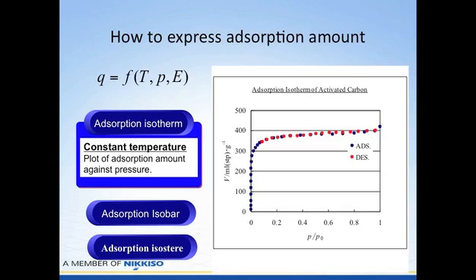But if we start right here, and just to let you know, this is typical of what's called a type 1 isotherm. And activated carbon has many micropores. This is indicative of a highly microporous structure. But as the relative pressure is increased, the gases are being adsorbed very, very rapidly, and it will follow all the way out to the end of the adsorption isotherm.